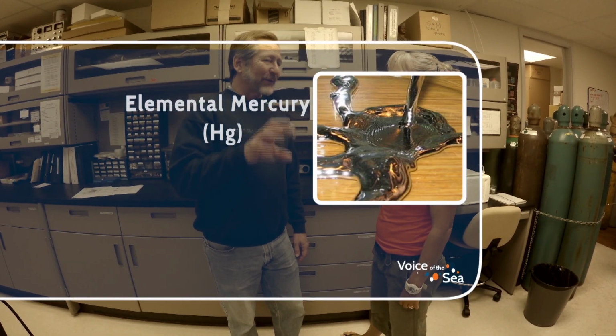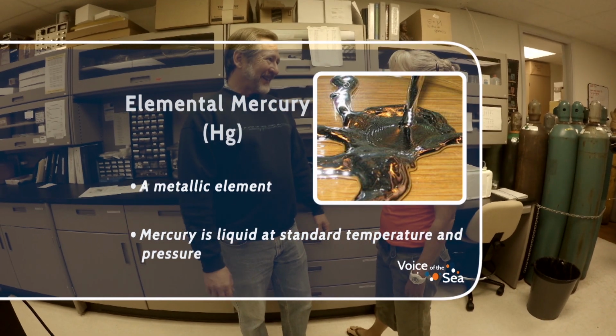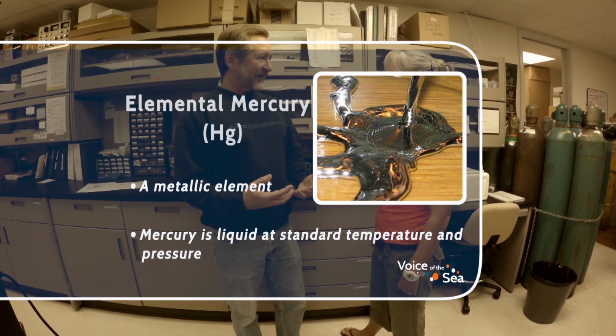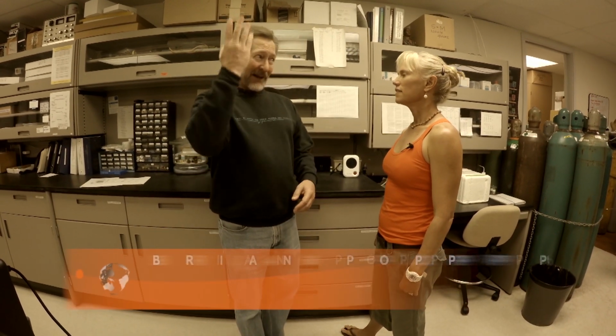When we bring our samples back here too, we want to be really, really careful about any contamination from the environment. We have special clean labs that we use only for our mercury analyses. We don't have to worry about that for nitrogen and carbon. There's no contamination that we have that's a problem. But if mercury gets in either from the dust on the floor or from fluorescent lights, there's a lot of mercury in fluorescent lights, that's a problem. So we have to use a special clean lab to do that.